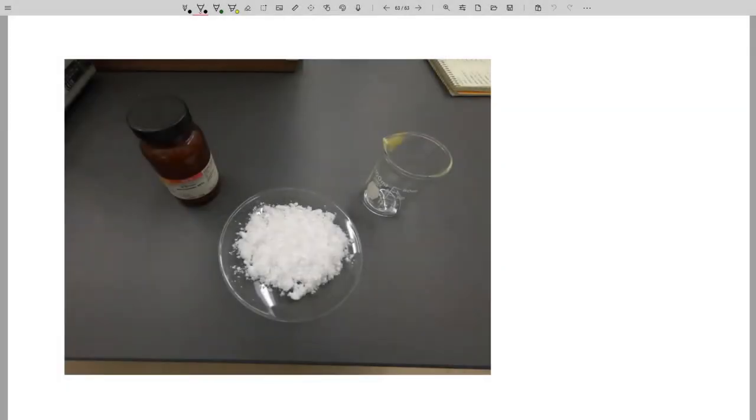Here is our final purified and dried material. This is a little over 20 grams. And remember that we started with 30 grams. So our recovery is somewhere between 65 and 70 percent. Now that's not terrible. We lost material, but you always lose material in a recrystallization. Now the benefit that you get from losing that material is you do get rid of impurities. So look at that yellow color in the impure material that's left in the residue on that beaker. So we did lose some material, but we gained higher purity material. And so that's the trade-off for recrystallization.